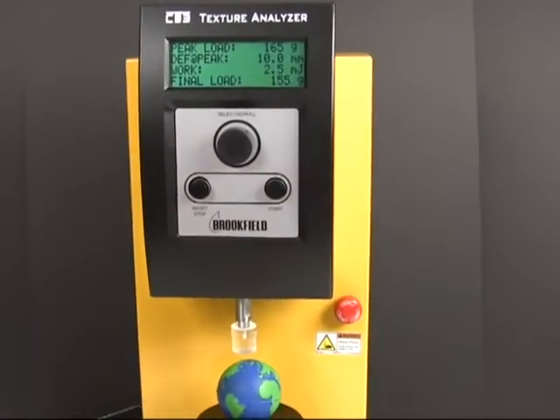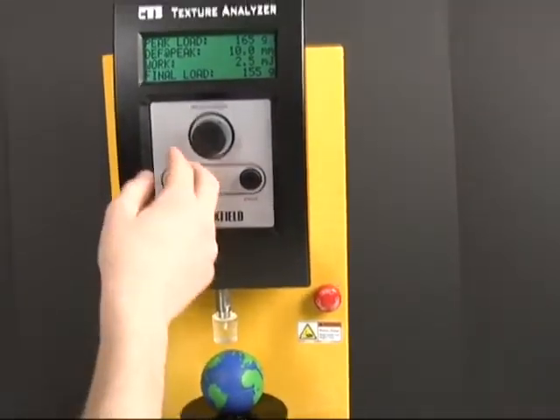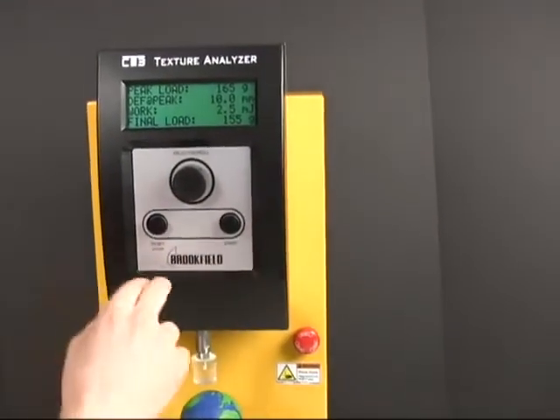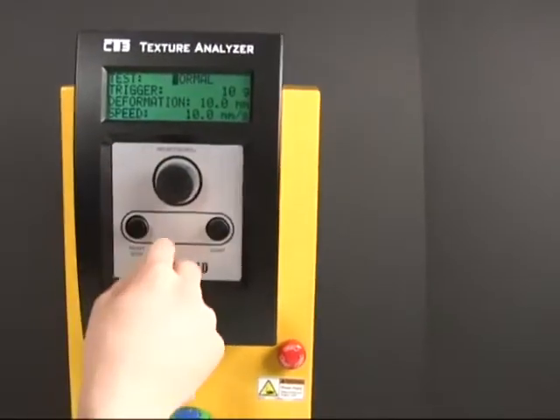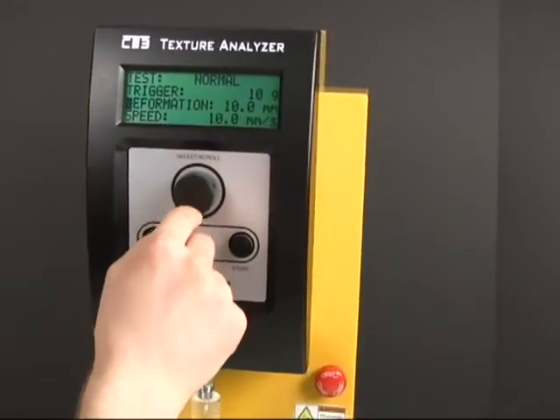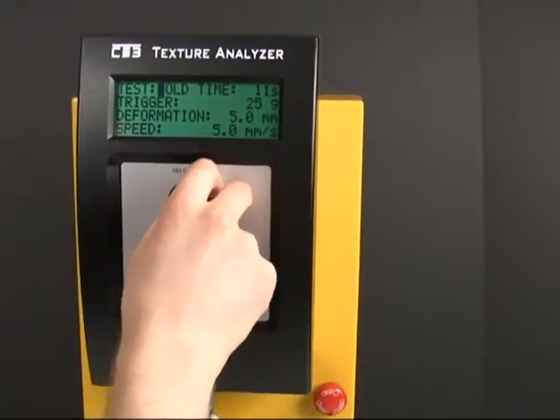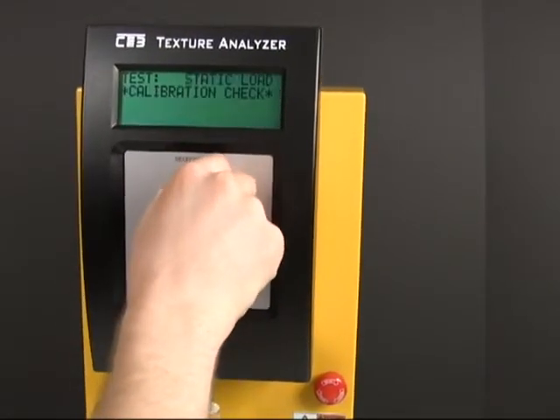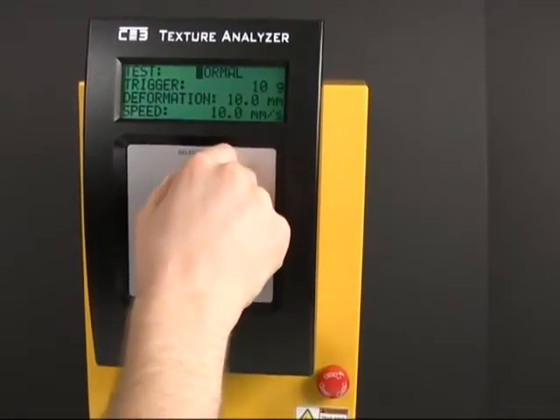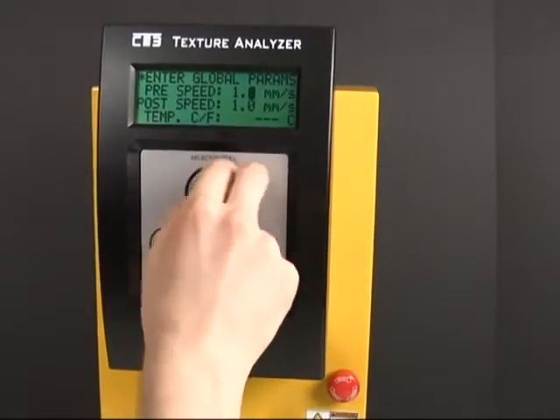That just took too long to go up and down — that's just a waste of time. I'm going to change that. The actual speed, the pre and post speed, aren't actually in the same window.